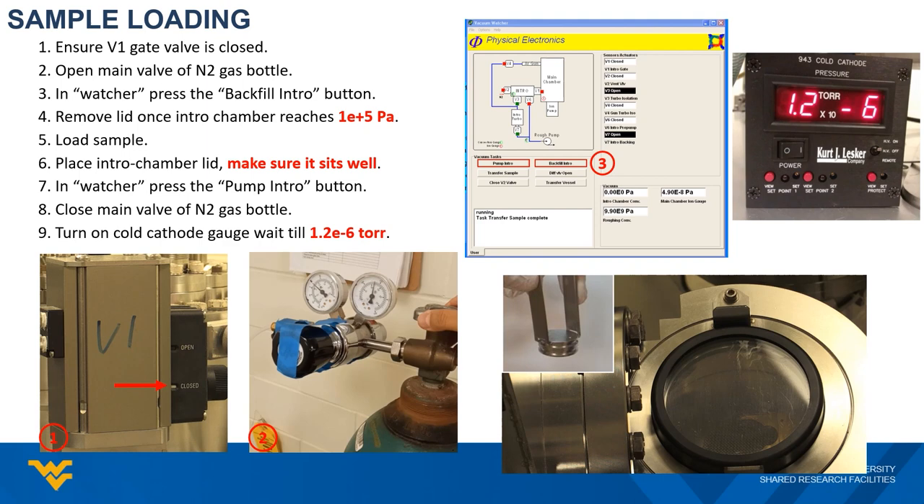Step three: back at the computer, locate the vacuum watcher software and push the backfill intro button. This will cut the intro chamber from the pumping line and open the vent valve to let the nitrogen gas into the intro chamber until it reaches one-atmosphere pressure.